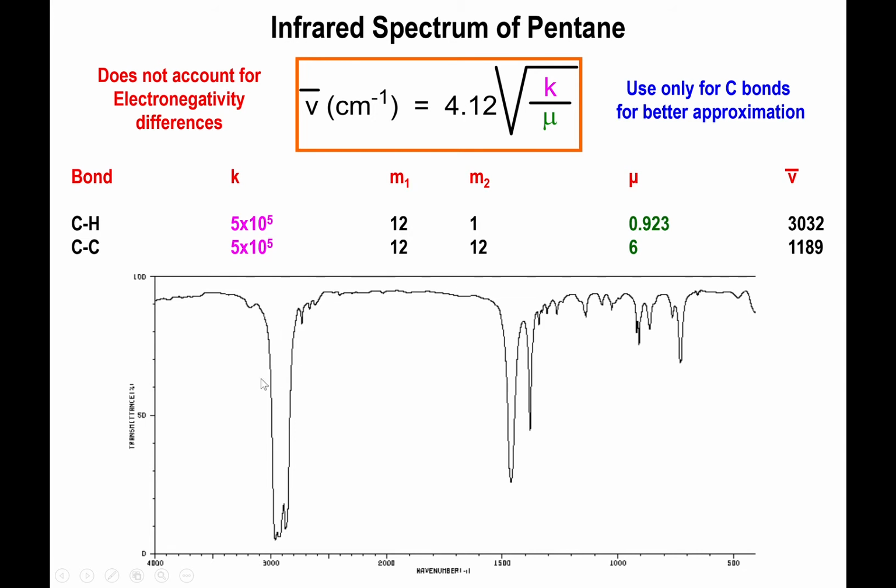So think of this as being an absorption, even though we're looking at it from the point of view of transmittance, right? But that's an absorption, that's an absorption, that's an absorption, right? And this is pretty strong. These ones right here are medium to strong in terms of their intensity.